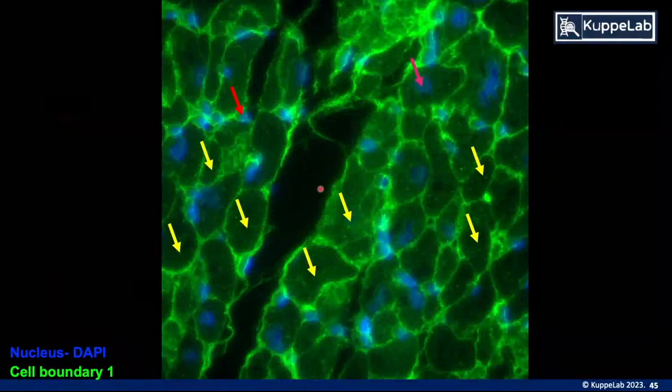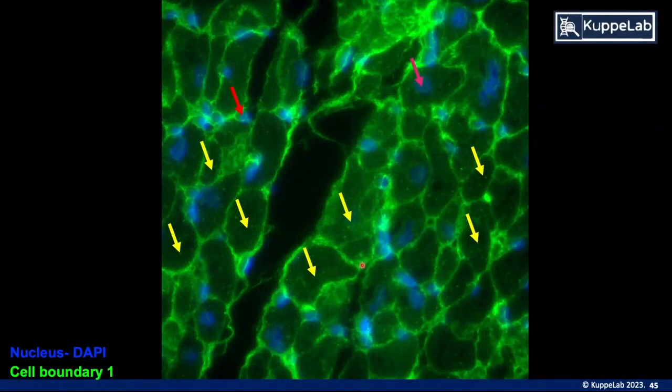I think important for a muscle tissue is to keep in mind that some of these myocytes may or may not actually have a nuclei signal included. And this is important when just relying on DAPI as a prior, because in the human heart, for example, if you use DAPI, only about 20% of all myocytes will have the DAPI signal in their cross-section. So you would lose lots of data if you don't include an additional border staining.